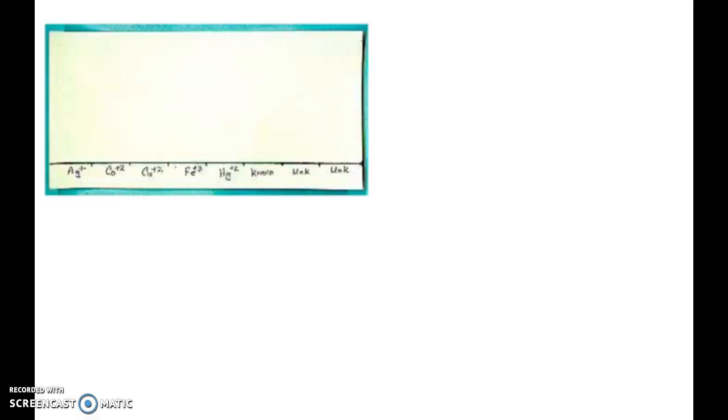So the last video here on paper chromatography is going to talk about the experiment itself. The way you're going to set this up is you're going to have a piece of this paper that you can get from the instructor bench.